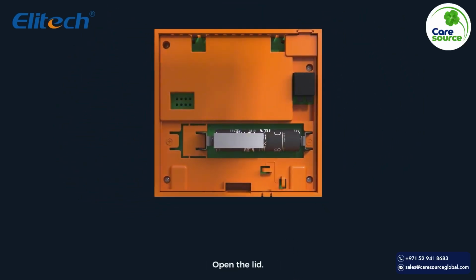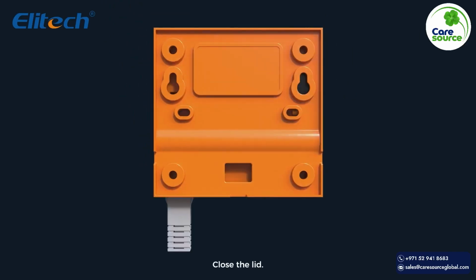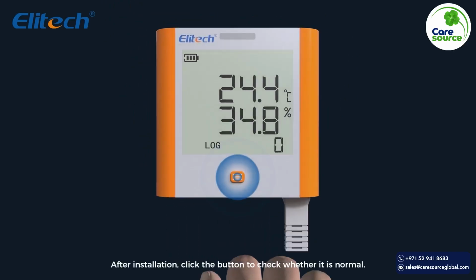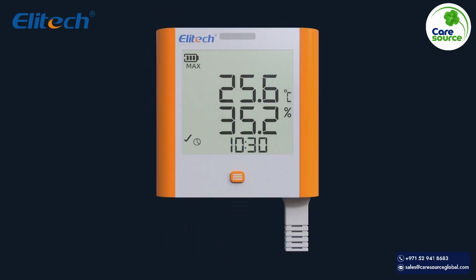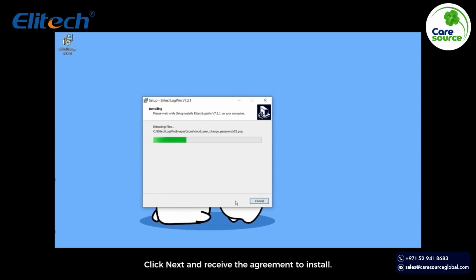Open the lid. Remove the insulating paper from the back of the device. The lid sticks first. Close the lid. After installation, click the button to check whether it is normal. Double-click the installation file to install ELITechLog software. Click Next and accept the agreement to install.